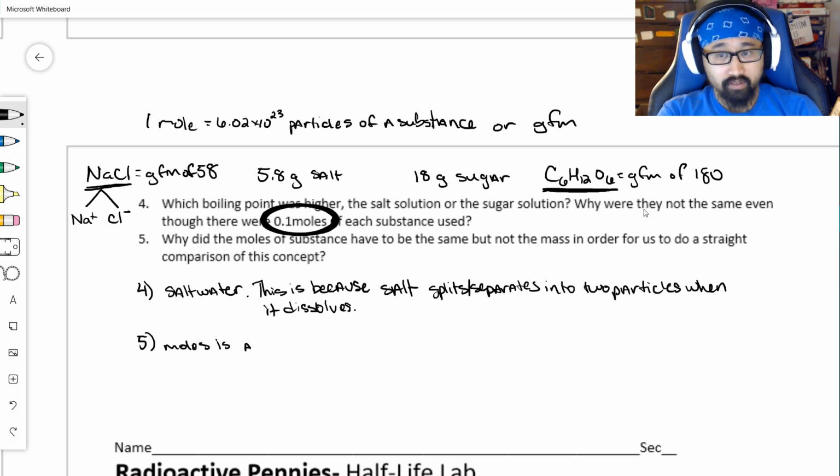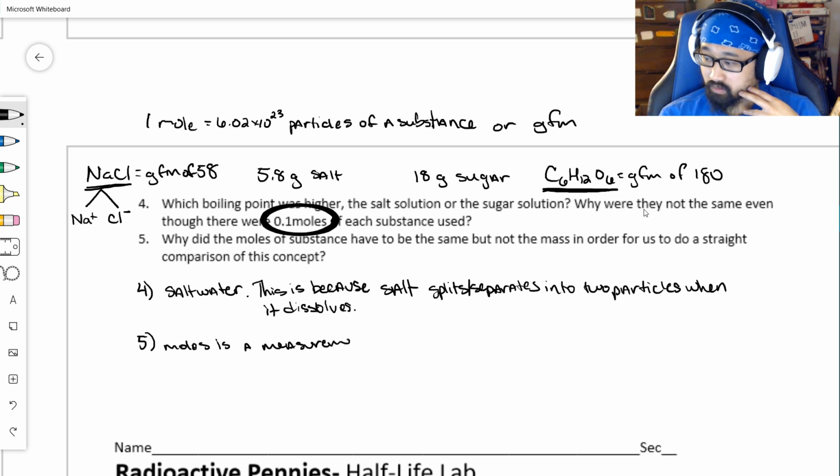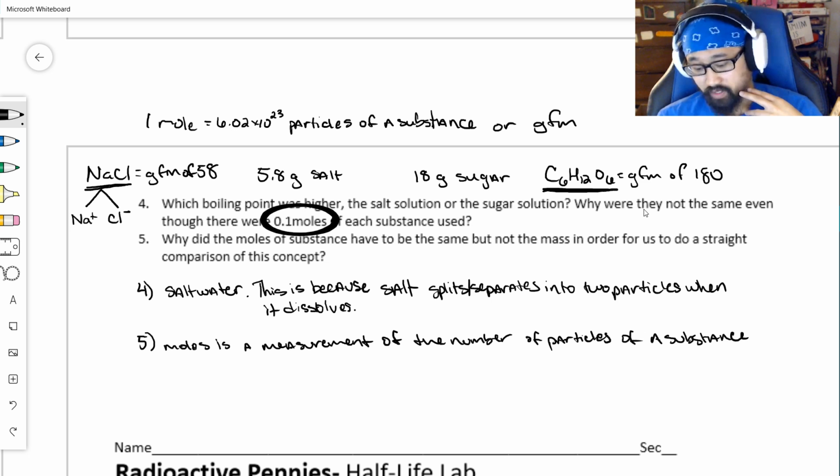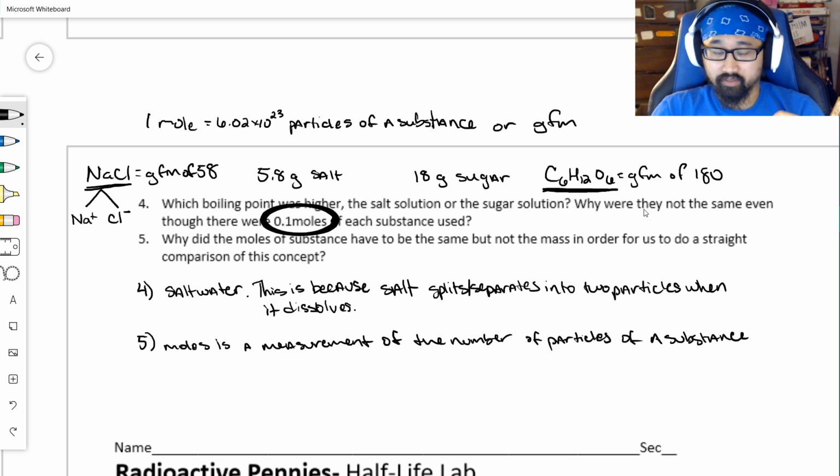But we're not trying to figure out what the effect of the mass is. We're trying to figure out what the effect of the particle is. So the reason we have to do moles instead of mass is moles is a measurement of the number of particles of a substance. And that is the concept we're trying to test. How does the number of particles of a substance affect the boiling point of a solution? Not how does the mass of the substance affect it.